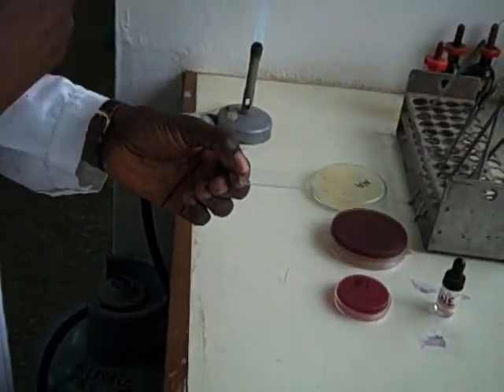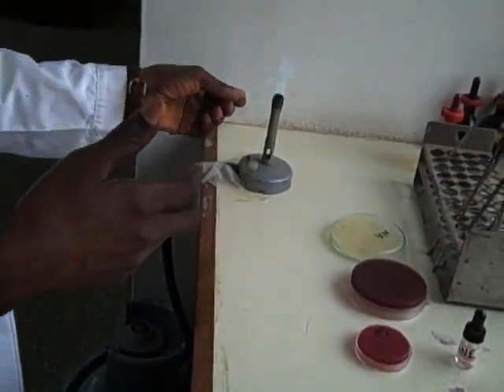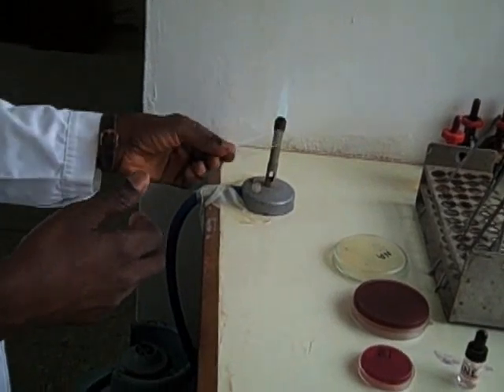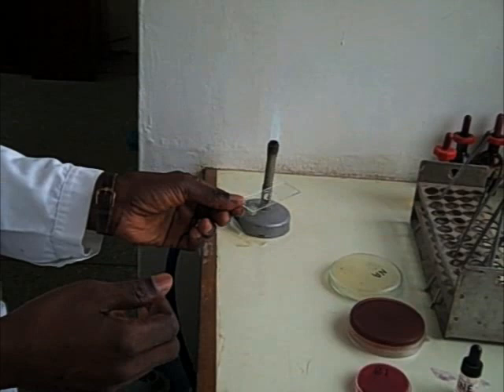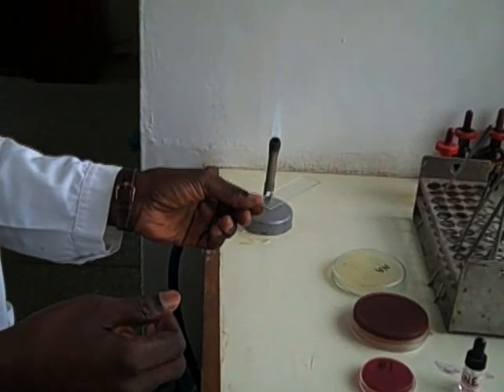After air drying, heat fix the smear by passing it through the flame about three or four times. This kills the organism, allows it to adhere to the slide, prevents autolysis, and makes the organism permeable to the stain.